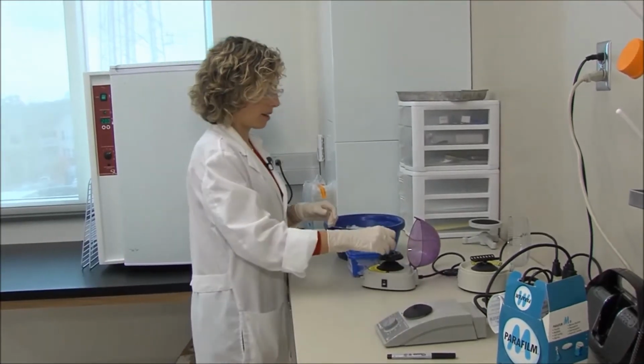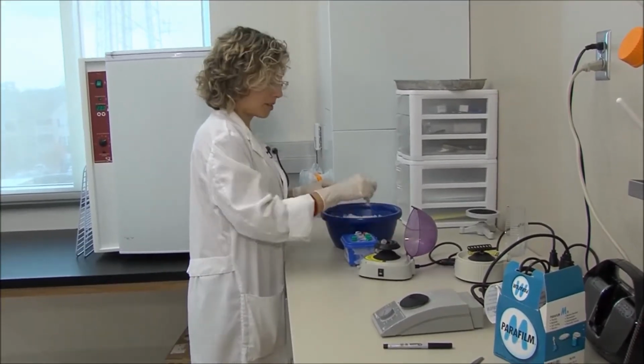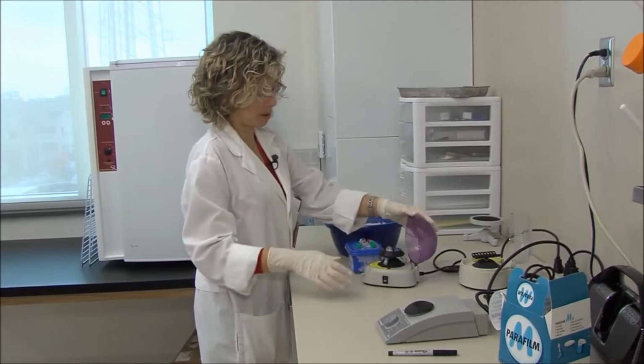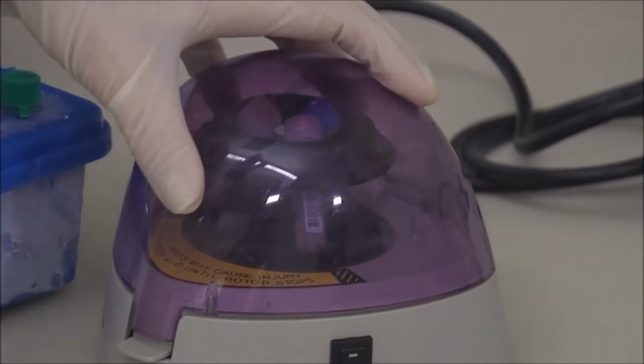And now we are gonna give them a quick spin to make sure that the liquid goes to the bottom and that we don't have any condensation on the lid.